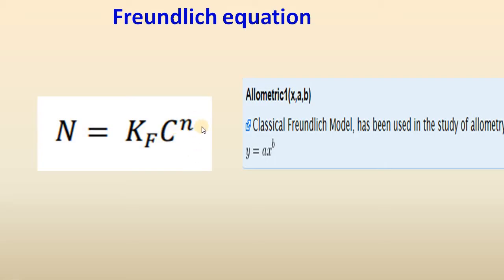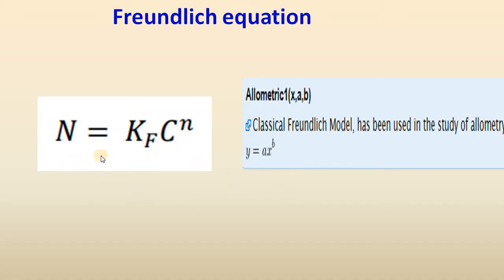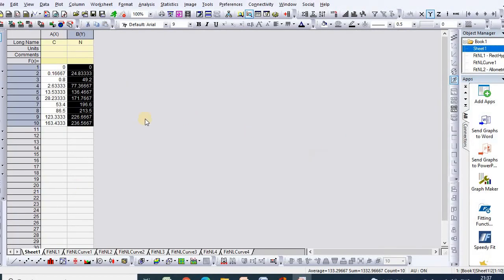If we compare this equation with the allometric one function, which is the classical Freundlich model, we see that n equals y, kf equals a, and n equals b. So if we fit the Freundlich equation with the allometric function, we can easily calculate the Freundlich equation parameters.